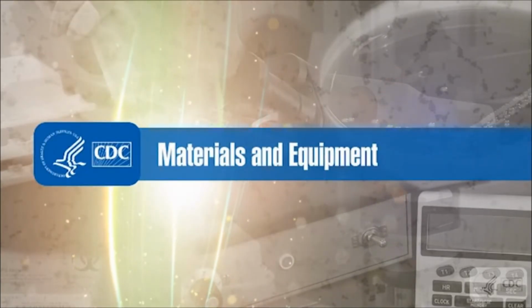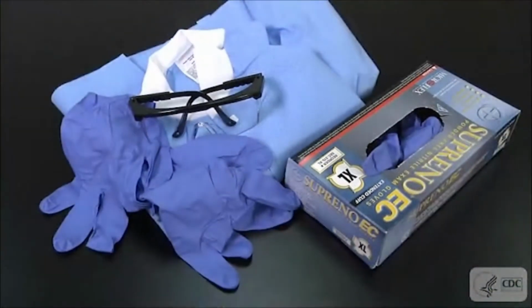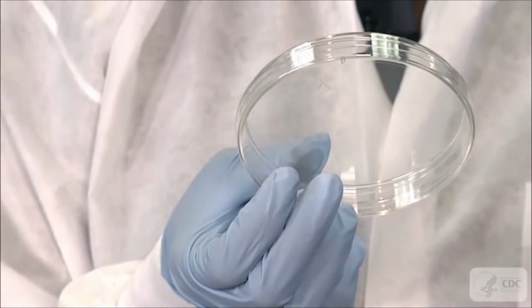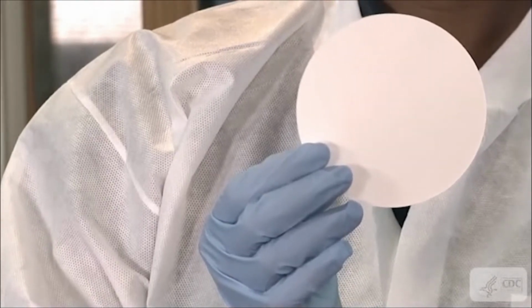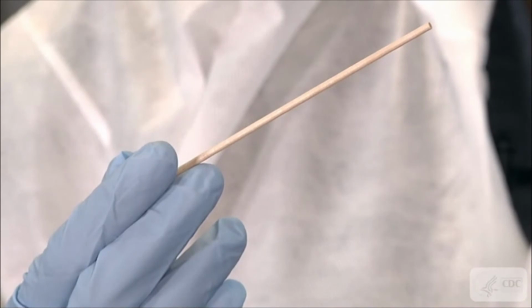For this procedure, you'll need the following materials and equipment. Personal protective equipment, timer or clock, sharps container, biological waste container and bag, disposable Petri dish, filter paper. Do not use the filter paper once it begins to darken. Sterile wooden sticks. You can also use platinum loops, plastic loops, or platinum non-nichrome wires.